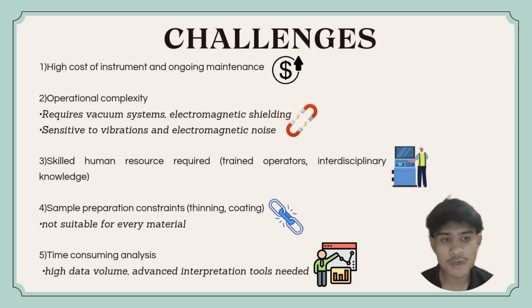Fourth, the sample preparation process can be difficult. It often needs thinning or coating, and it's not suitable for every material. Lastly, the analysis can be time consuming because of the large amount of data generated. It also requires advanced interpretation tools to make sense of the result.